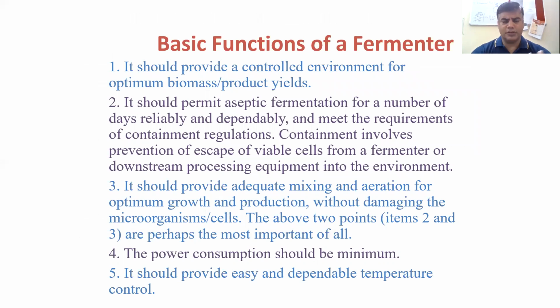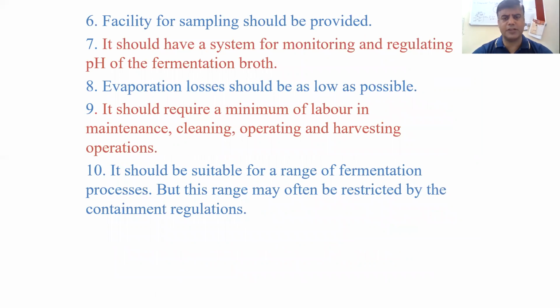So if we discuss the basic function of the fermenter, it should provide a controlled environment, permit aseptic condition, and provide adequate mixing and aeration for optimum growth and production without damaging the microorganisms. Power consumption should be minimum. It provides easy and dependable temperature control. Facility for sampling should be provided.